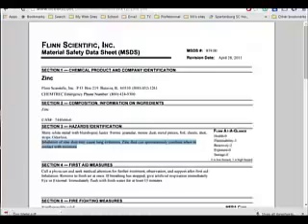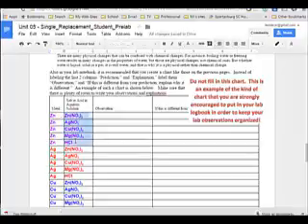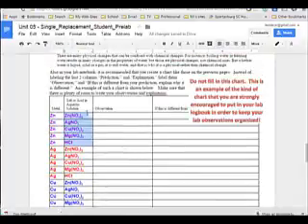However, for the compounds, let's go back to all these compounds here. Each of these has to have separate listings for hazards. Now, how many compounds do you have? Four. Five. And they repeat themselves, same compounds. See that? All right.